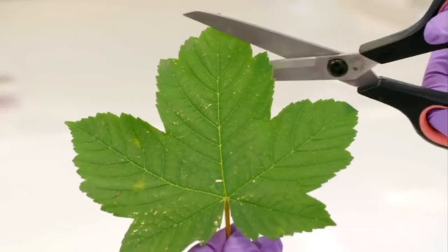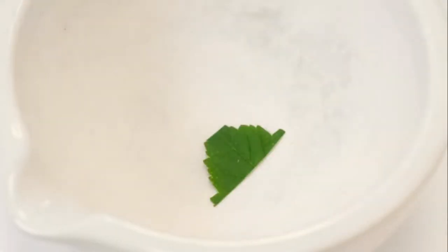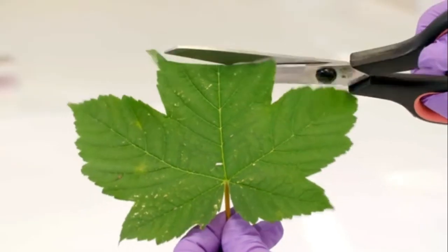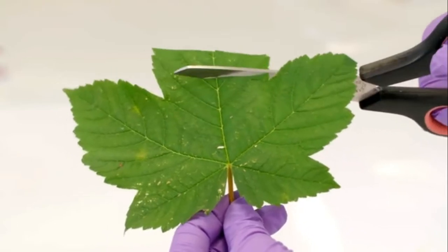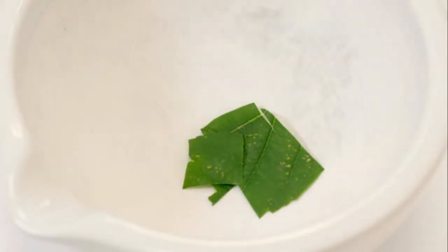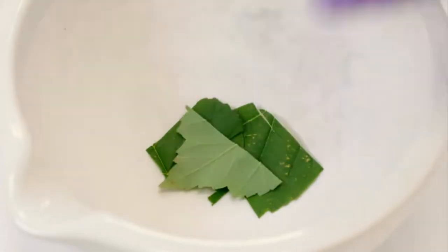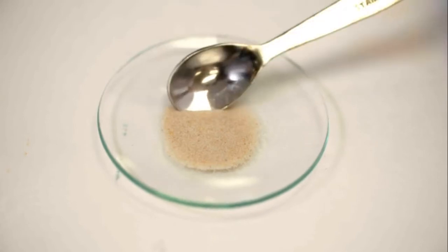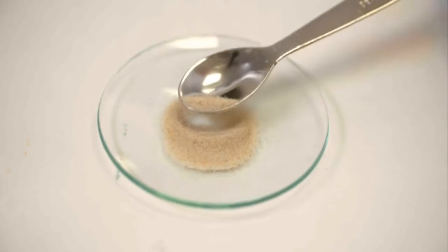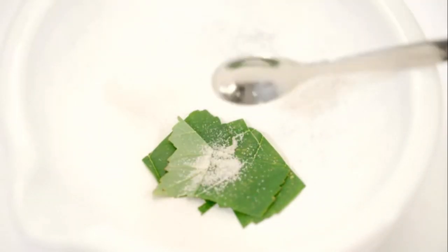To make a leaf extract, a leaf is first cut up into small pieces using scissors and then the leaf pieces are added to the mortar. Next, a pinch of sand is added to the mortar. This is used to break open the tough plant cells, releasing the pigments.